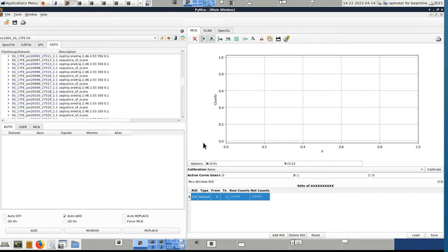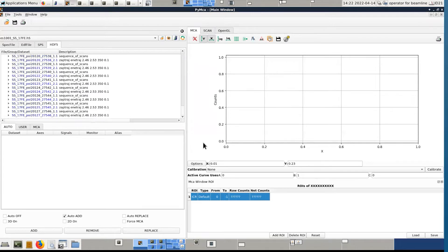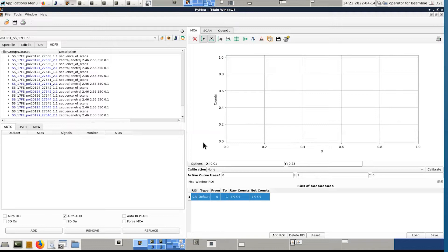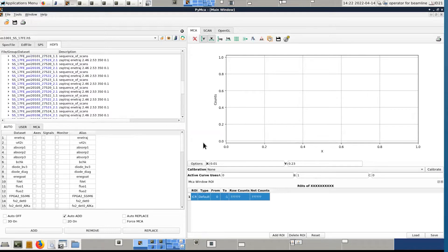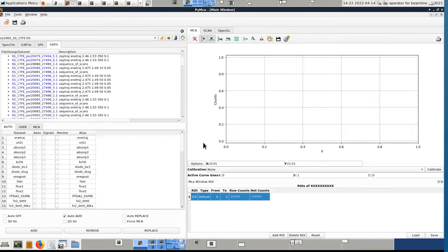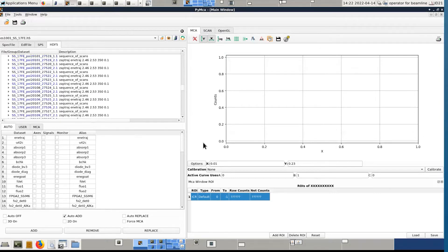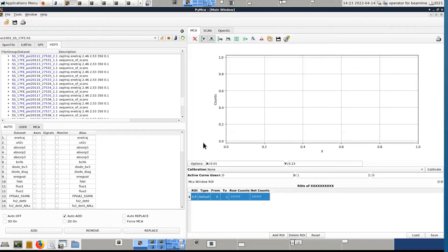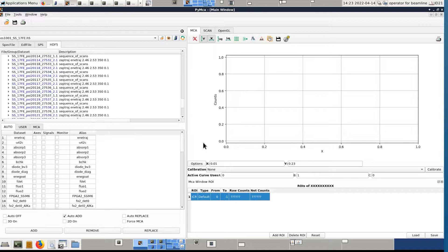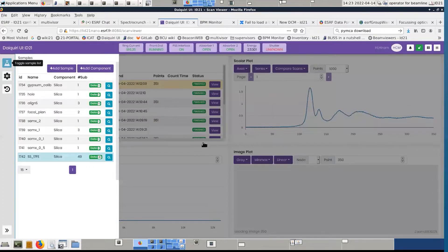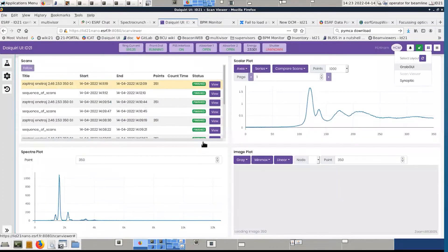So we are interested now in XANES data. So that's typically the way XANES files or scans will appear in your H5. It starts with a sequence of scans, and it will have one scan per iteration. So here we did only one XANES per point, but previously we did five iterations per point.